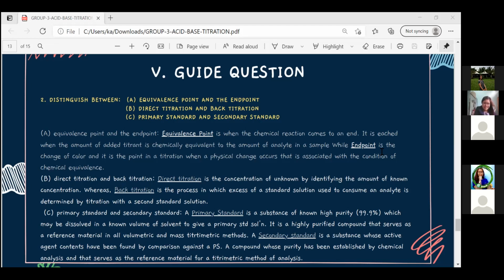So, sa distinguish between direct titration and back titration, ang direct titration is a basic titration method that involves the reaction between the unknown compound and the compound with known concentration. Doing this method will only give one chemical reaction, kasi ang isa ay known man. At mangyayari lang ang method na ito sa paggamit ng isang known compound at isang unknown compound. Basically, if madali kunin ang endpoint, ito ang method na usually ginagamit.